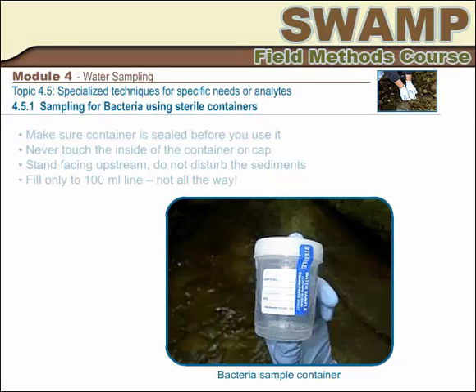When sampling water for bacterial counts, you can use sterile plastic 100 milliliter vessels, or sterile bags known as Whirl-Paks. Either way, you need to familiarize yourself with the important things to keep in mind when handling sterile samples aseptically. Plastic vessels that are used to sample drinking water are sold with a small amount of sodium thiosulfate, a reducing agent that is added to neutralize the residual chlorine present in the water so it does not kill the bacteria in the sample. Try to get containers without thiosulfate if you are sampling ambient waters.